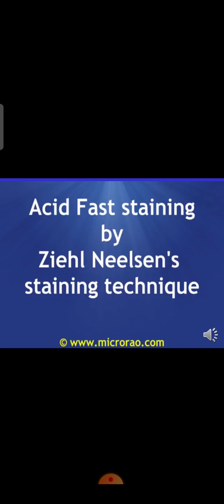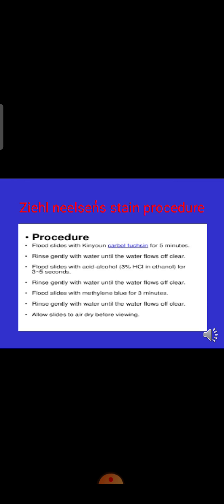The reagents used in this technique: the first stain is the carbol fuchsin, the counter stain or second stain is the Loeffler methylene blue, and the decolorizing agent is 20% H2SO4. It's a compound stain. There is a modification of the Ziehl-Neelsen staining procedure called the Kinyoun modification. Here we flood the slide with Kinyoun carbol fuchsin for 5 minutes. Here the Kinyoun carbol fuchsin contains phenol.